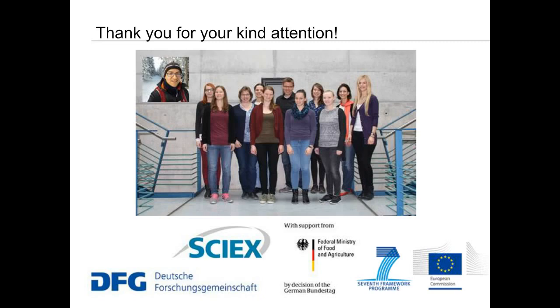But of course, there are some laboratories around that now start next generation sequencing as a detection tool for species authentication, and this is indeed promising when you have food which is not incredibly complex, and if you do not want to precisely quantify. So one of the problems, at least as far as I can see, with next generation sequencing is if you want to really detect minute amounts and quantify minute amounts of a given species in a complex food. This, as far as I can see, can be a problem. But on the other hand, next generation sequencing is of course as well a pretty powerful technique when it comes to species authentication.